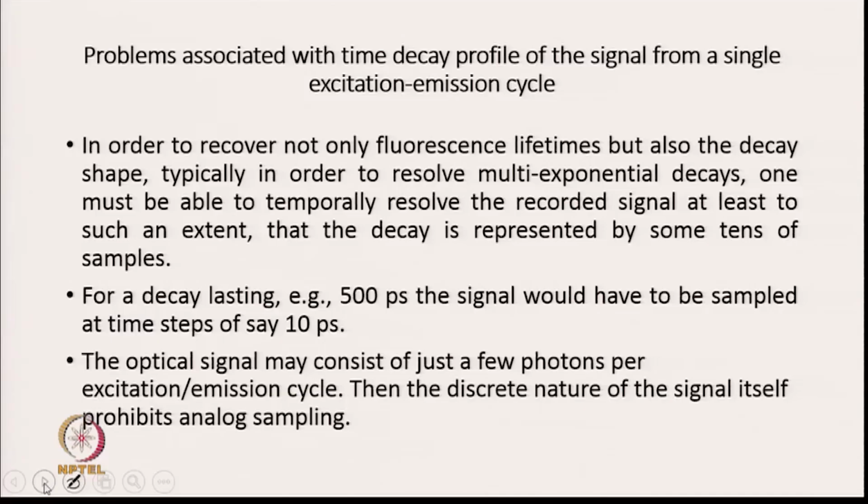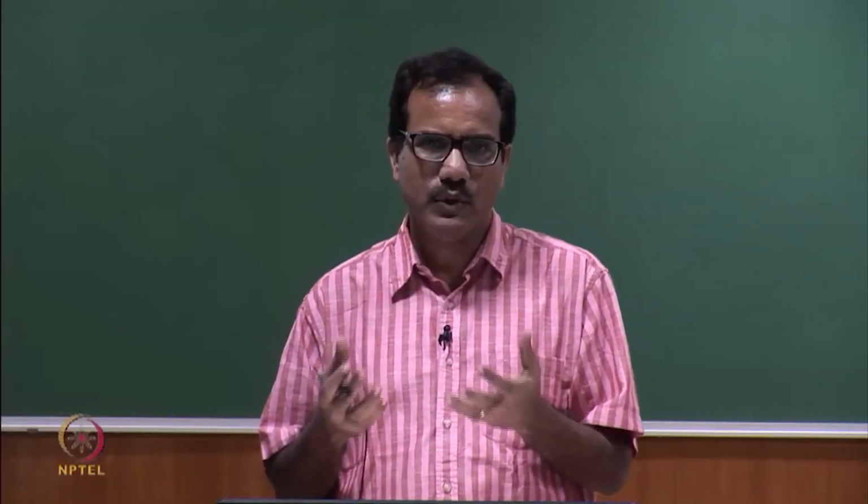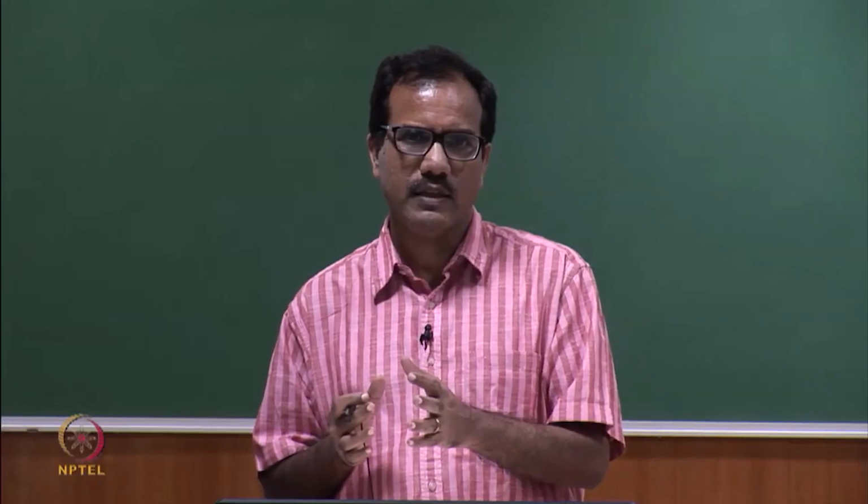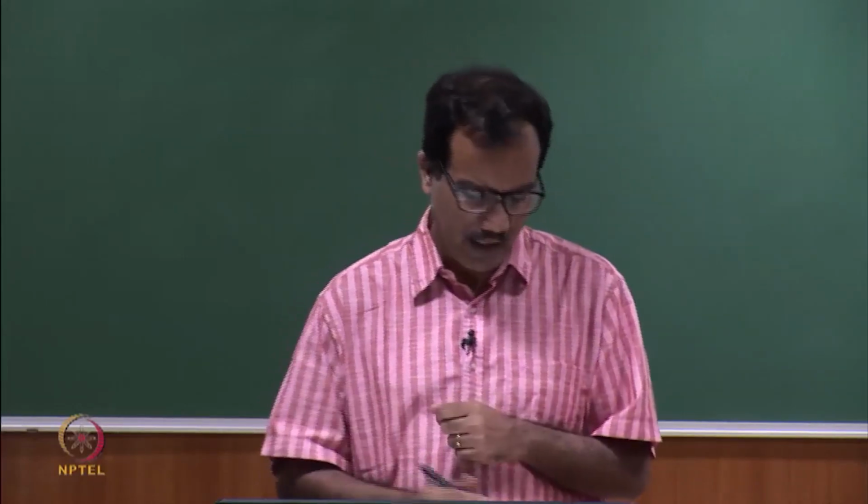Optical signal may consist of just a few photons per excitation emission cycle, and so the discrete nature of the signal itself prohibits analog sampling.